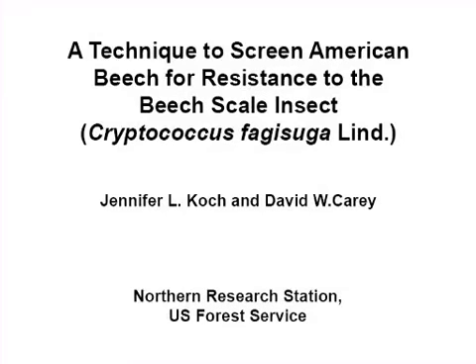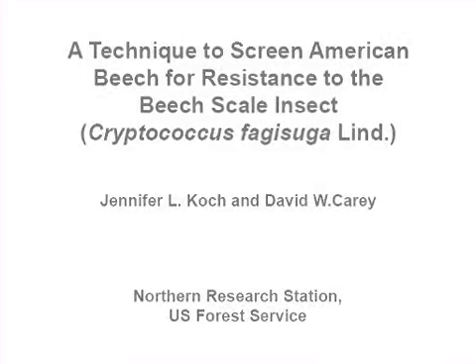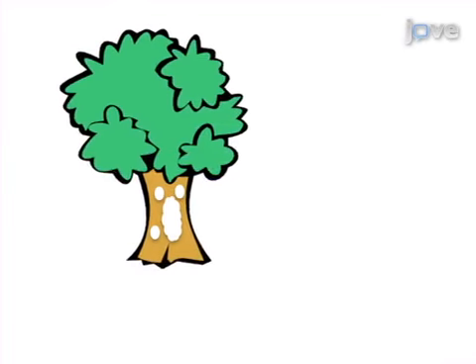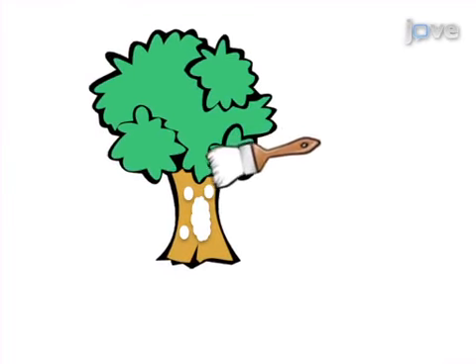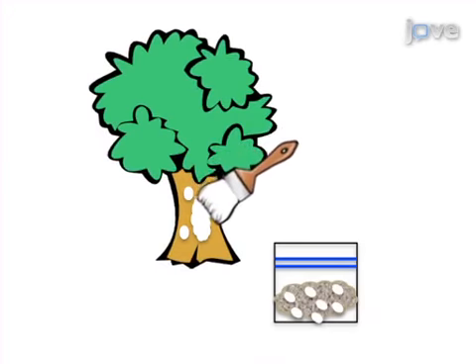The overall goal of this procedure is to distinguish between beech bark disease resistant and susceptible American beech trees. This is accomplished by first collecting adult beech scale insects and their eggs directly from American beech trees.